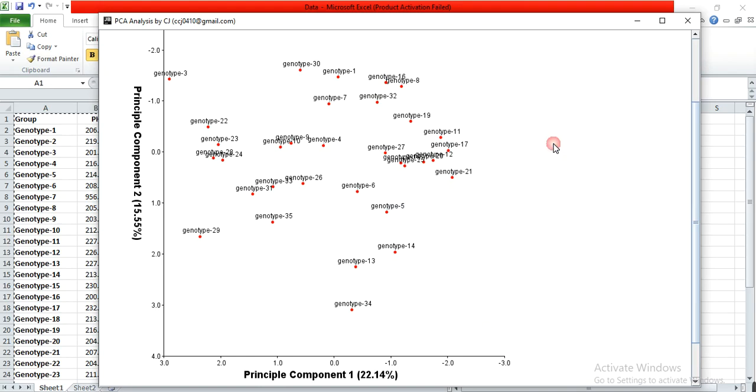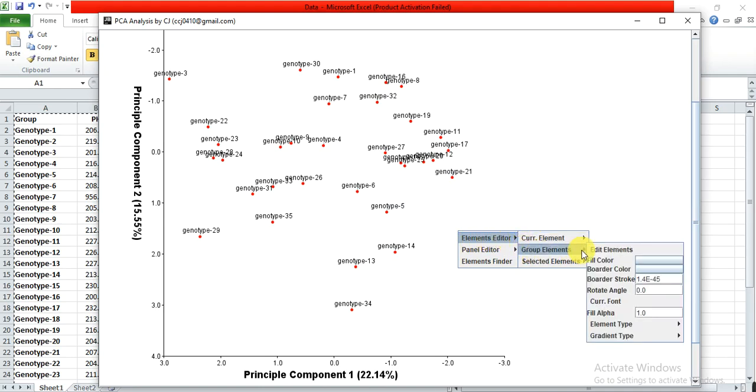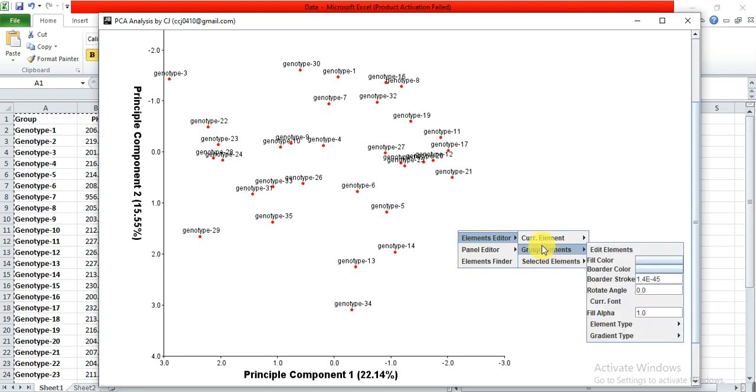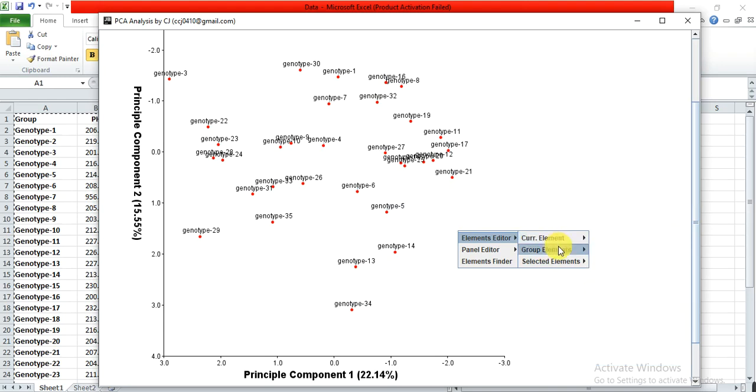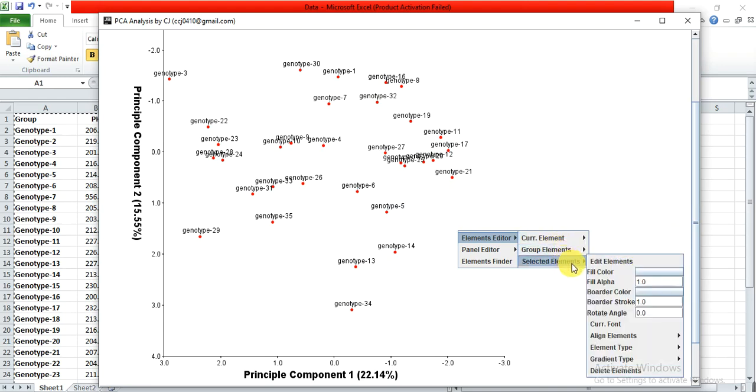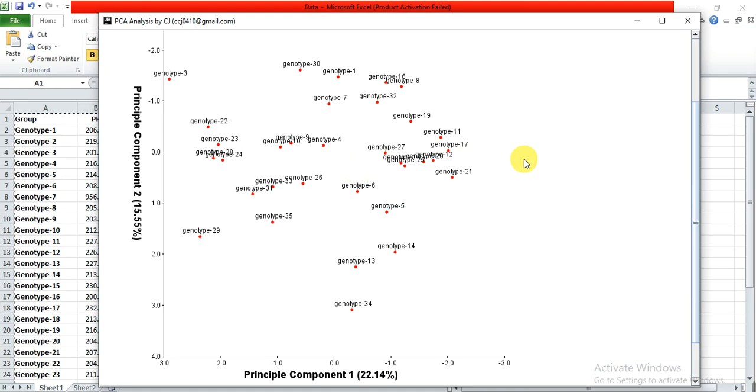In this way, you will do Principal Component Analysis in TB Tools. You can also modify this graph by right-clicking here. There are many options: Element Editor, Group Editor. From here you can change the background or border color, and for each element you can change the color and sign of each genotype to differentiate them. You can edit the graph according to your choice and make it more beautiful.